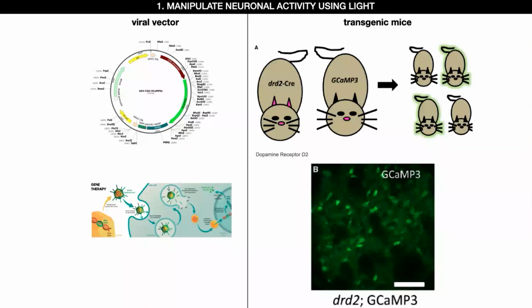And those viruses will be integrated into the host cell that can then express the gene that we engineered within the viral DNA.